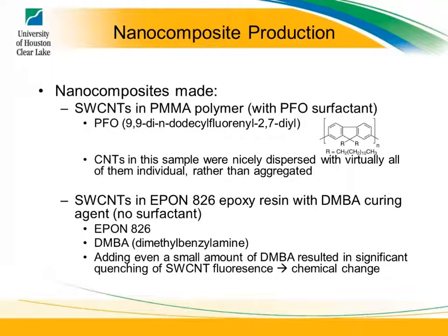So I take a little bit of nanotubes, just a pinch. Very hard to measure this because I'm looking at microgram quantity putting in the solution. I first looked at single-wall nanotubes in PMMA. If you don't know what PMMA is, everybody knows what plexiglass is. One of the first polymers ever made. Plexiglass is PMMA, polymethyl methacrylate.